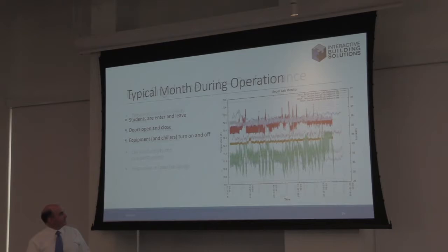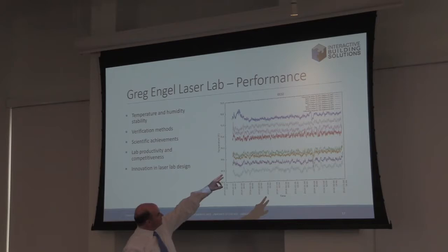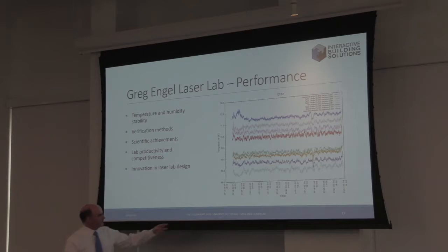So now we're sitting at about 0.05 degrees across the largest outlier, which is actually next to a piece of, it's the fifth position on my table that I monitor. It's right next to a piece of heat producing equipment with the cameras, up to 0.10 degrees. And this curve goes for about a day and a half. So this is the length of a typical experiment. So over the course of an experiment, we hold about a 20th of a degree.